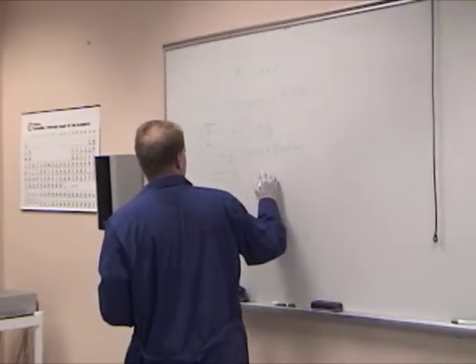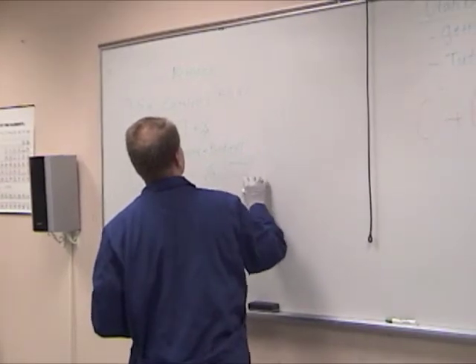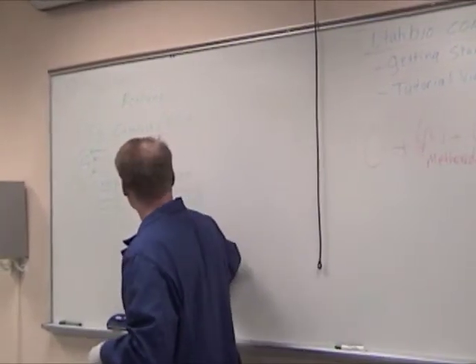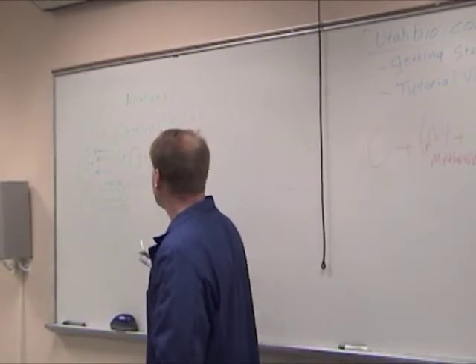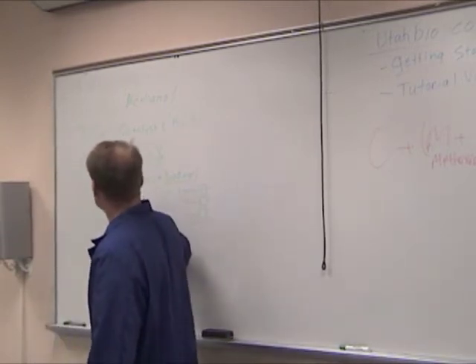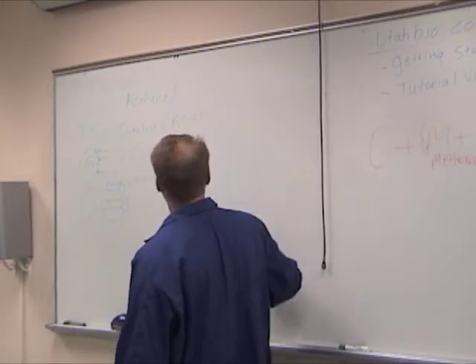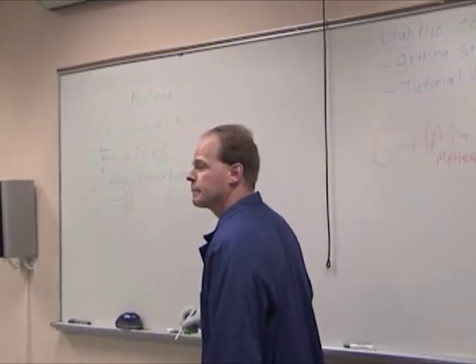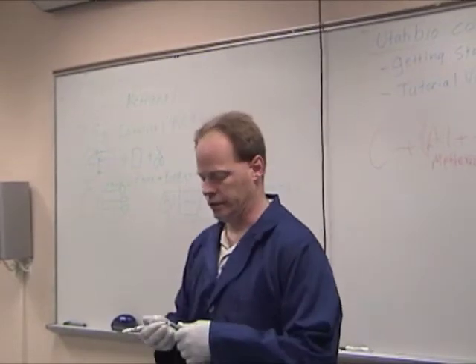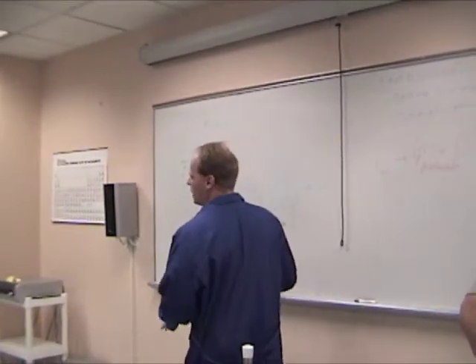Okay. So what we get on the back end is we're going to get some glycerin. And we're going to get these fatty acid chains hooked to methanol. Well, the glycerin molecules are heavier, so they're going to fall. And these are going to stay up top. And so out of these two molecules or things, I've gotten one, two, three, four different things. Much lighter substance, as you saw, it was much less viscous. And so what we end up with is biodiesel on top and glycerin on the bottom. We remove the glycerin, we wash it, which we won't go into in this class, and we've got biodiesel that we put in the vehicle, unmodified, and drive on down the road. Okay? That's the basic premise behind biodiesel and the chemistry of it.